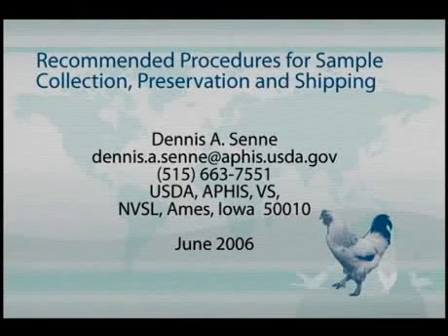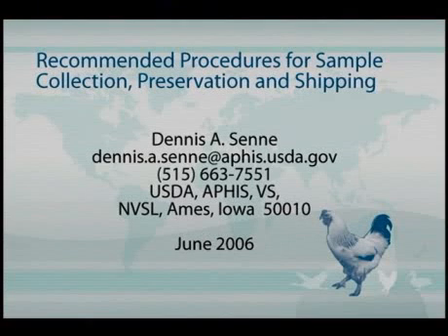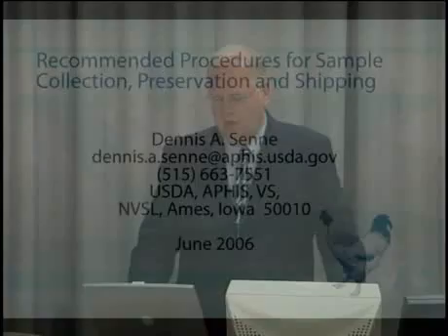Okay, in this presentation we're going to review some of the recommended procedures for sample collection, preservation, and shipping. Most of you likely have your own standard way of collecting blood from poultry, but if you don't, I'll provide you with some possibilities on ways that you can collect blood.